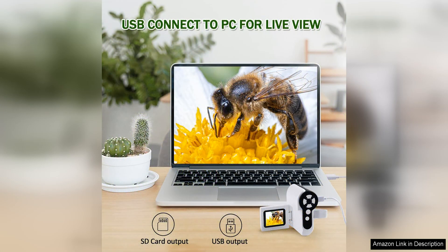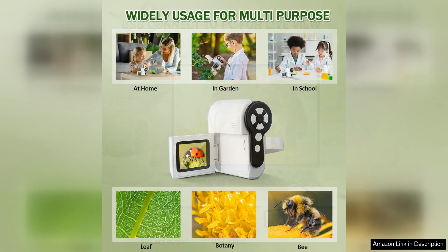Parents can feel confident in the durability and quality of this microscope, as it is made from high quality materials that are built to last. The microscope also comes with a sturdy carrying case for easy storage and transport, ensuring that it can be safely kept when not in use.